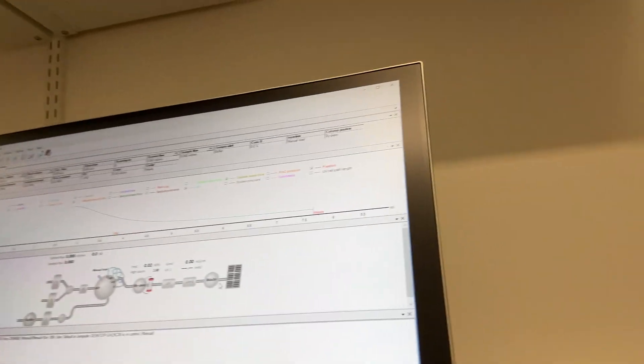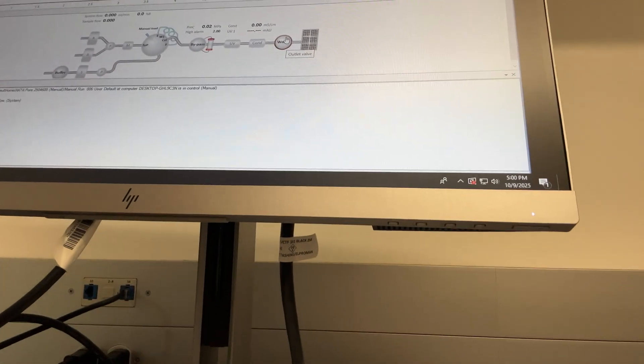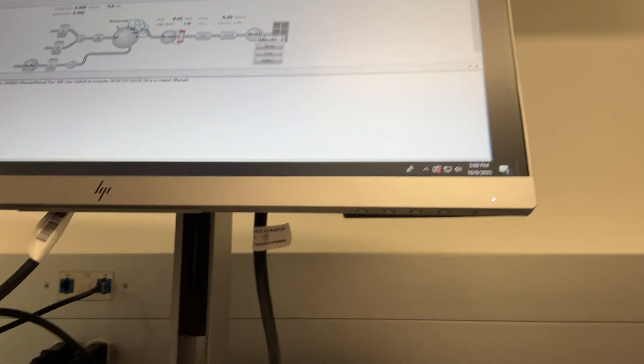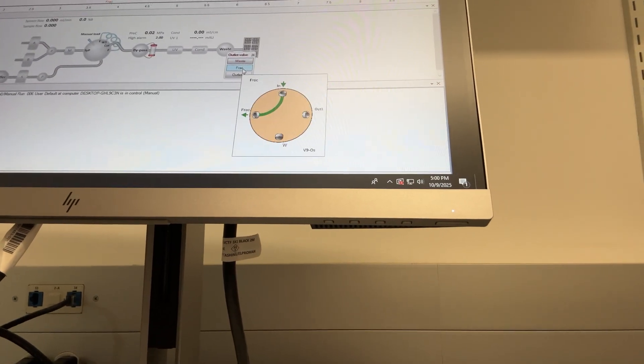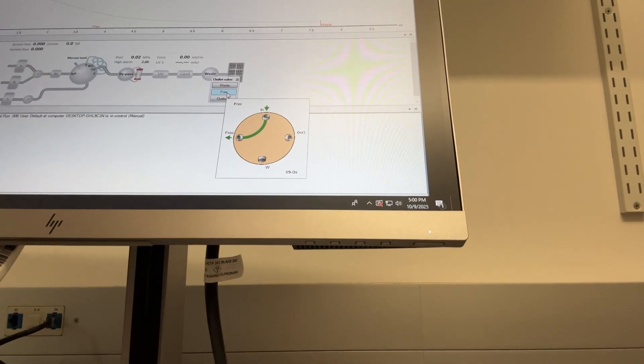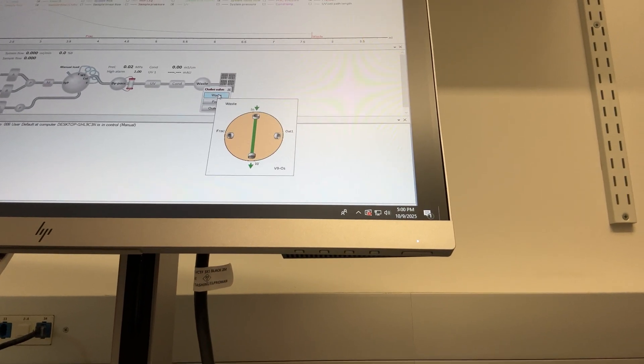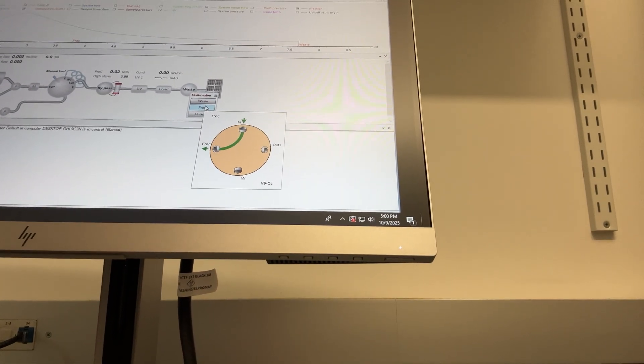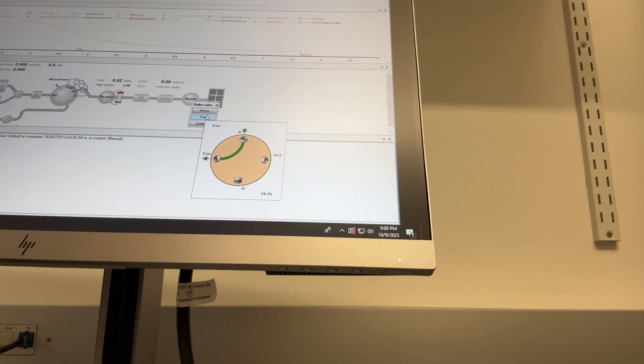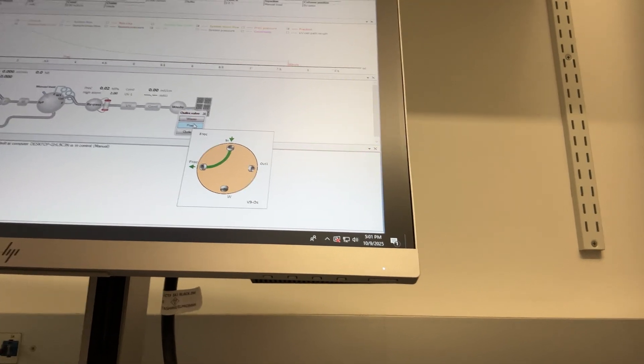And so right now we have it by default set to go to waste or outlet valve. You need to set that outlet valve to frack. And that is going to take it to the fraction. So you can see here you're going to waste. Here you're going the other direction and you're going into that fraction collector.